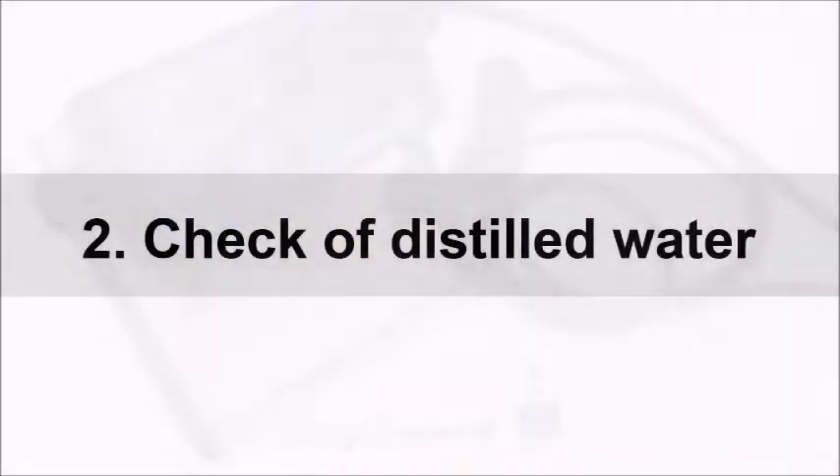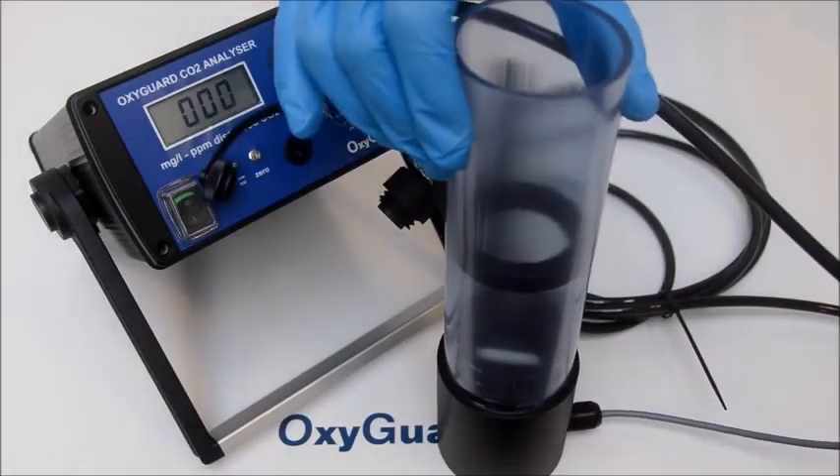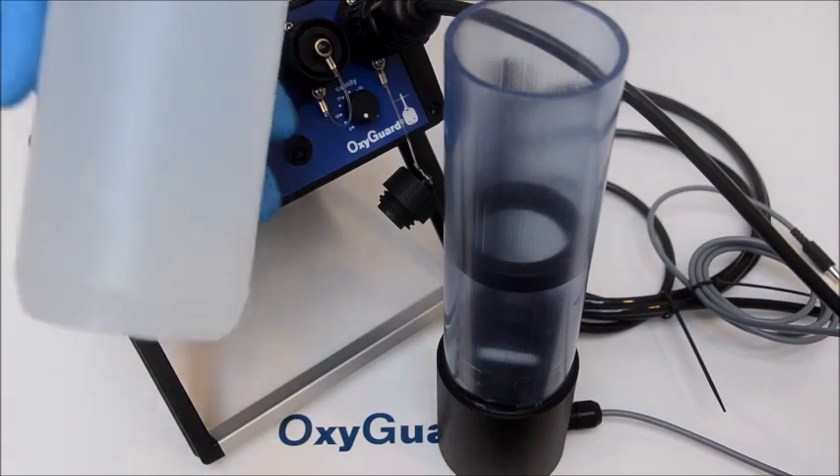The next step is to check the distilled water. Fill the calibration beaker with some distilled water — half full is enough.